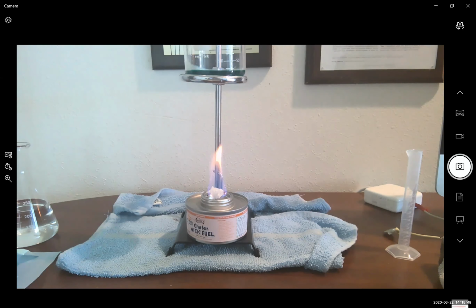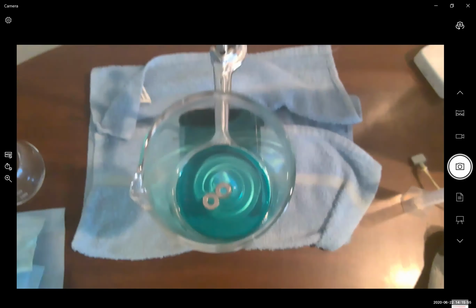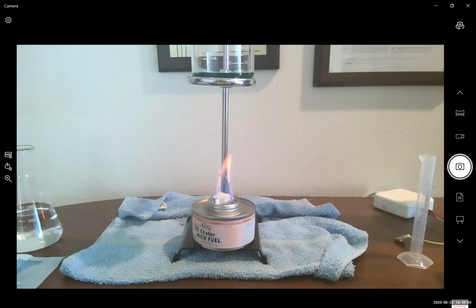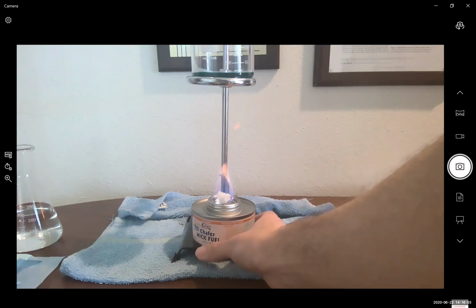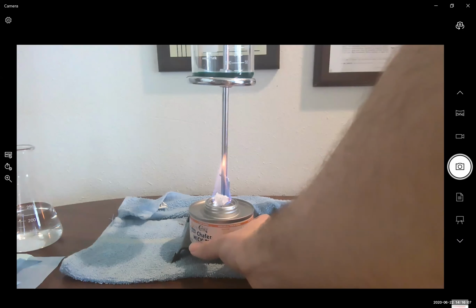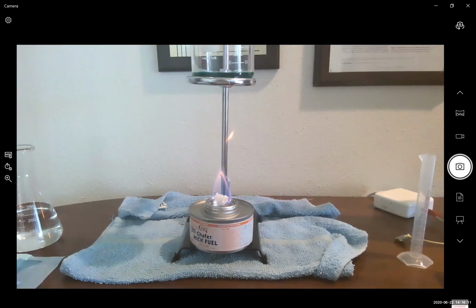The aluminum cup had our aluminum washers. If you look closely inside our setup, we have our aluminum washers, and we have our sterno flame that's applying heat. Let's move it over just before it gets started, and we have our beaker.